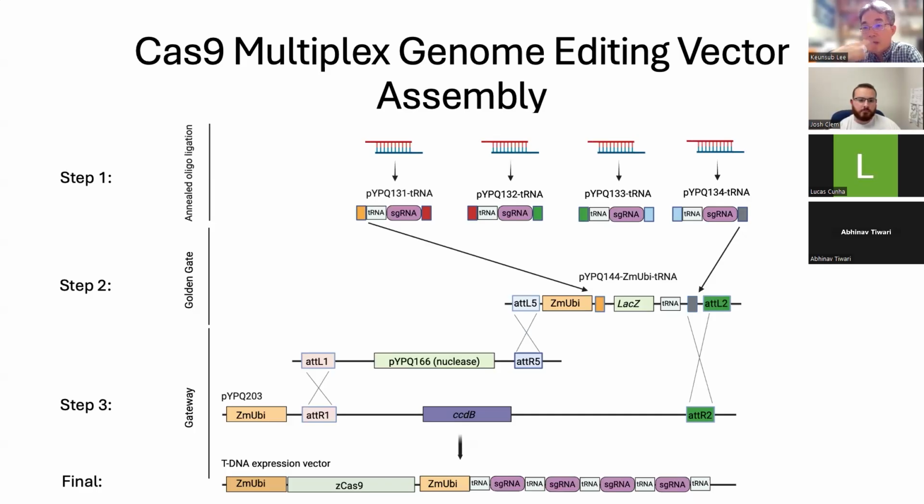Okay. Yeah, I think another thing you can consider when you're selecting guide RNAs is the promoters you are actually using for guide RNA expression. Whether you're using U3 promoters and U6 promoters or polymerase 2 promoters, as Josh just mentioned, then your cloning strategy will be a little bit different.